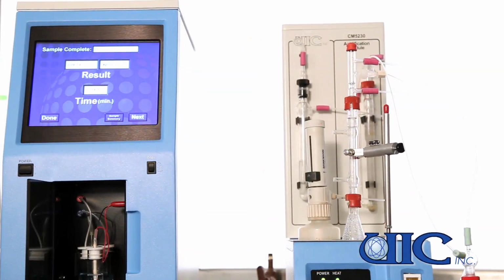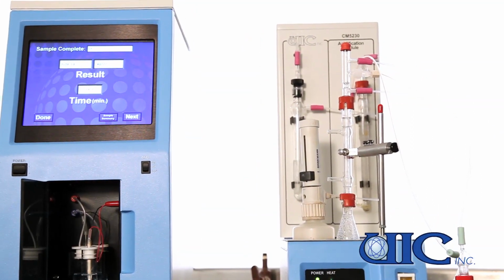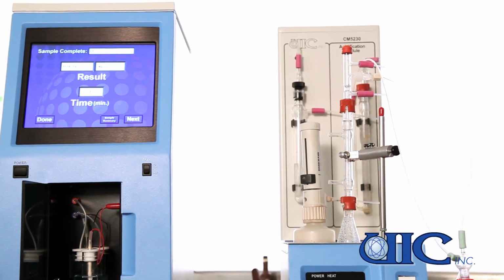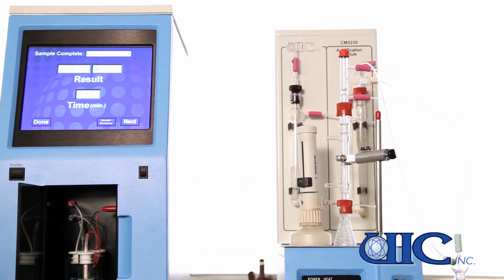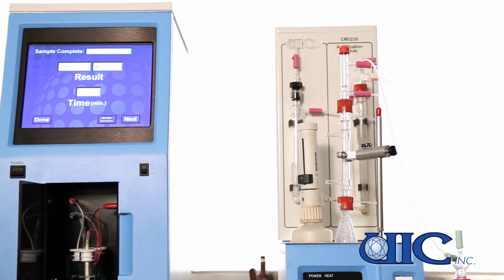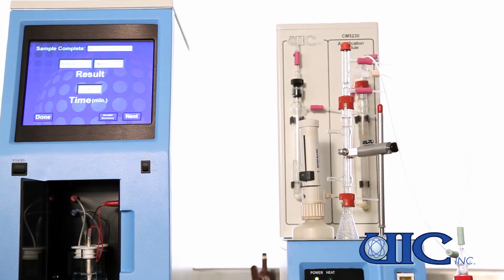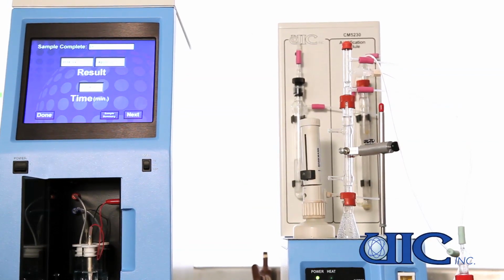We finished our standard analysis and everything looks good. The reason why we run a standard is just to make sure everything's operating properly with the coulometer. The coulometer itself is calibration free, so we don't need to run multiple standards to establish a calibration curve. We can go right onto our samples.